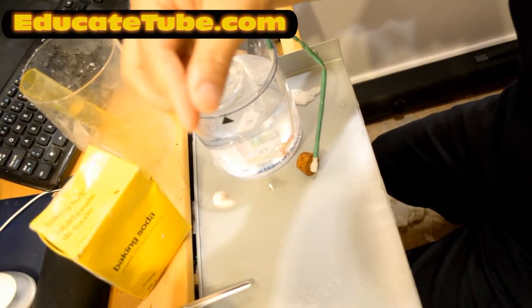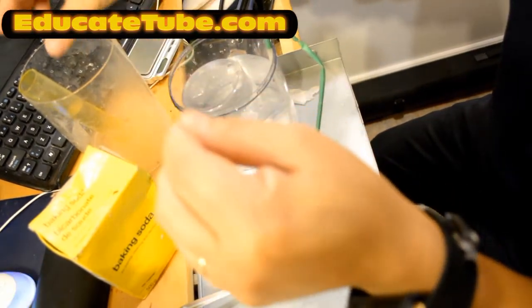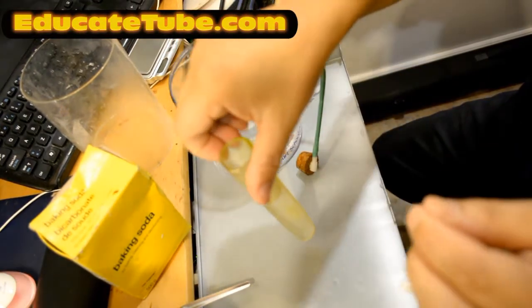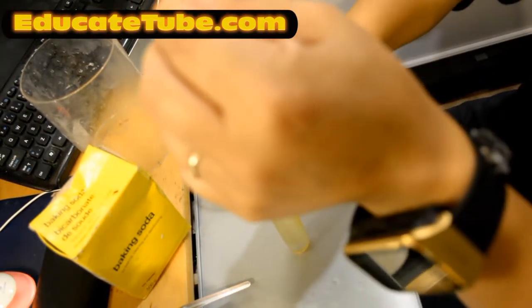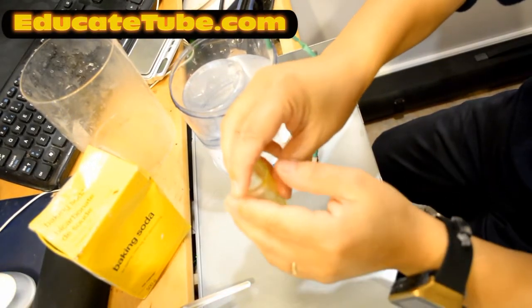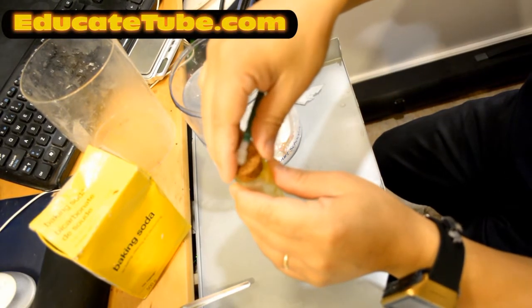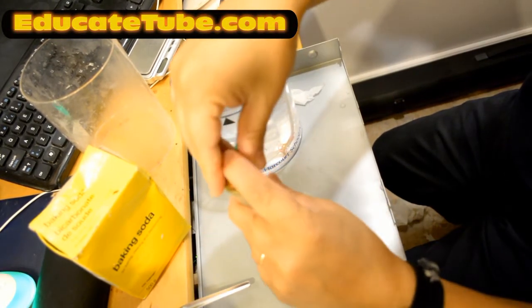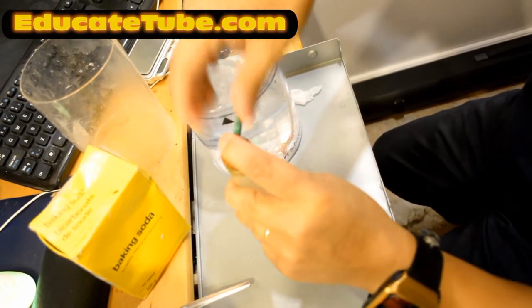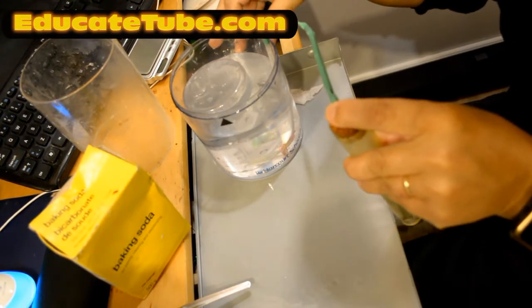Okay, so here is the sodium bicarbonate, 1 gram. It's gonna be put into the reaction chamber. This is the acetic acid, 5%, or we call it vinegar. Okay, let's put it like that for now. Alright, ready to cap this off. So once it's in, there we go. We're now gonna close it tight. There we go. You can see here the bubble is forming, a lot of it.